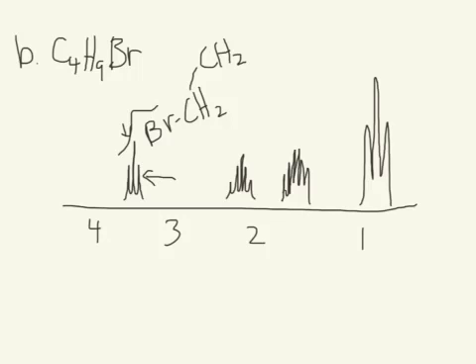To the right of 1 is probably a methyl. The integration line is big, so it confirms that. What is that methyl bonded to? Let's look at the splitting. There's 3 peaks, so there must be one less hydrogen on the neighboring carbon. Again, a CH2.